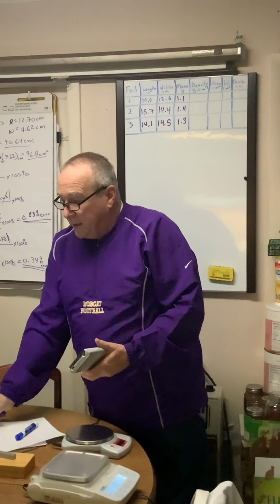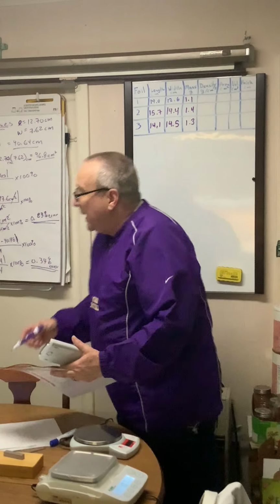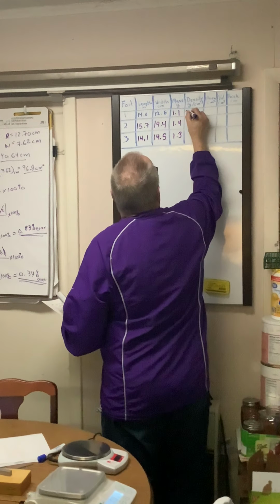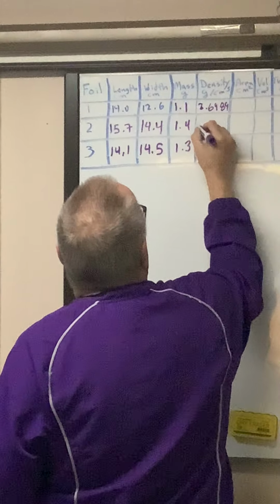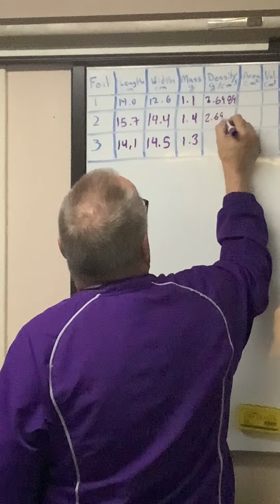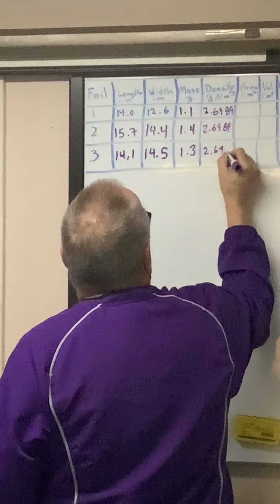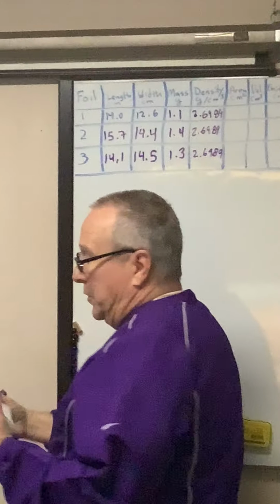So let me just make a note about the density. It says 2.6989. Very accurate. 2.6989. And this lab is probably about 10 years old.